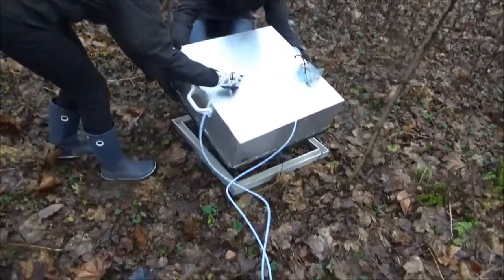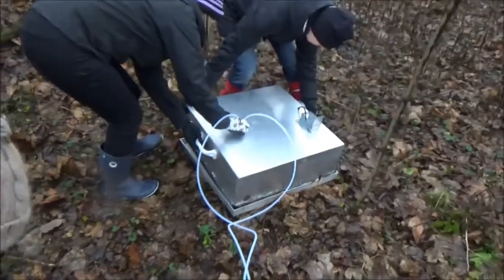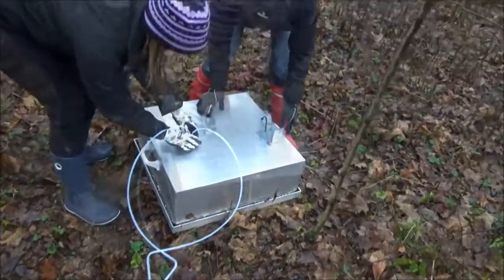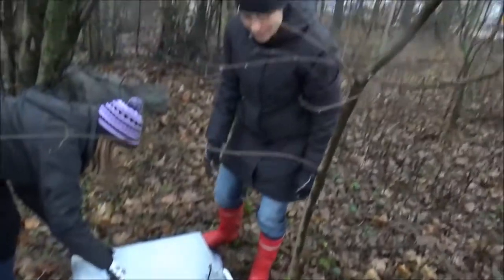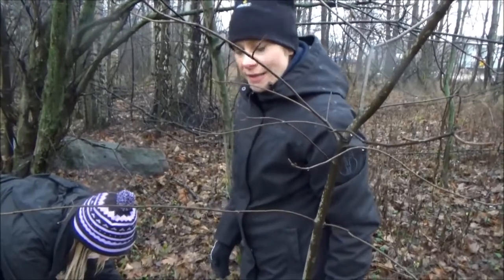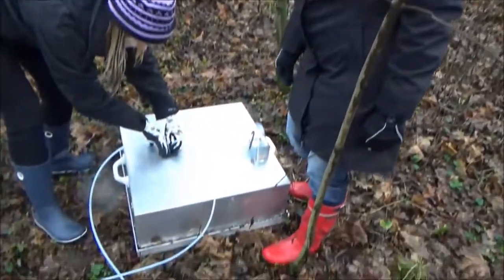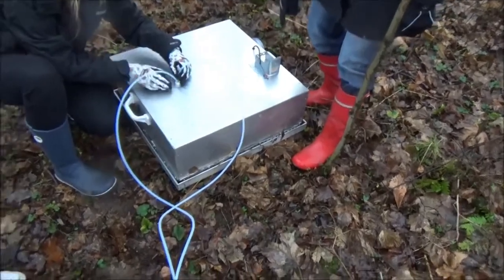Before installing the lid, the analyzer was turned on and a few measurement points were taken from ambient air. Now the chamber is in place and we can start following what we see in the instrument. We have to be sure that everything is closed, that we have a closed circuit to the analyzer.